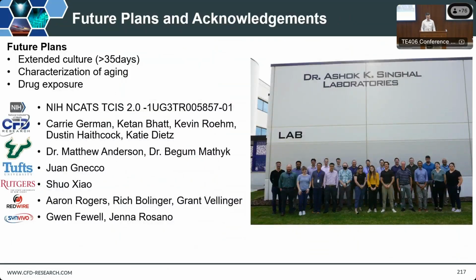Future plans are that we would like to get our culture extended out to about 35 days. We need to fully characterize the aging and then start exposing the chips to the drugs that we have found as potential repurposing candidates.